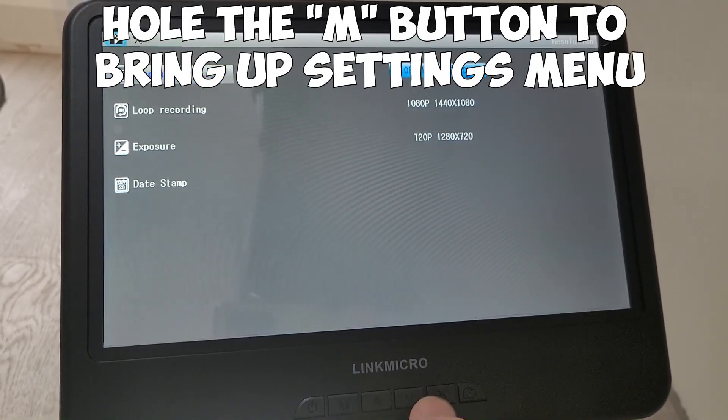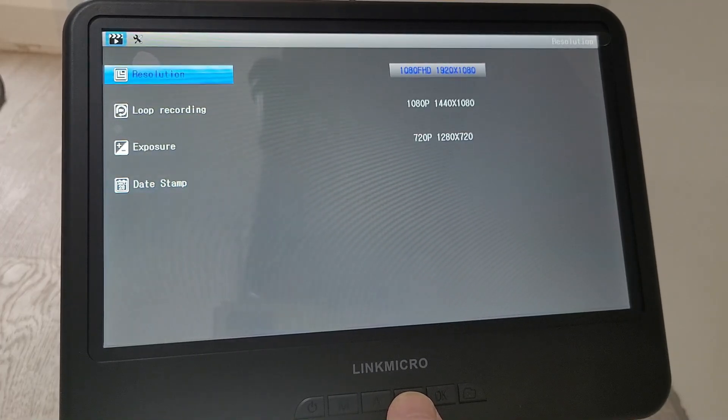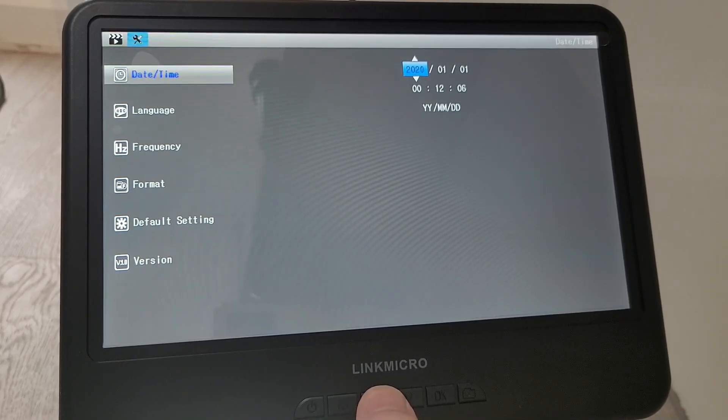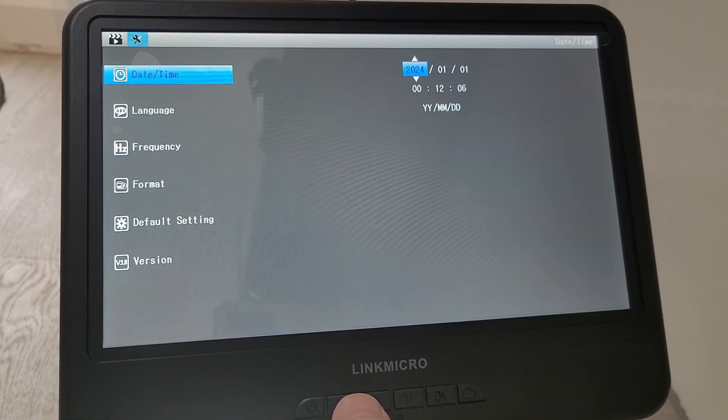Holding the menu button brings up the menu. You've got your up and down options, your resolution settings, and you can set the time and the date. There are lots of features on there so you can fine tune it and get a nice perfect picture. It's all about practicing and trial and error to begin with.